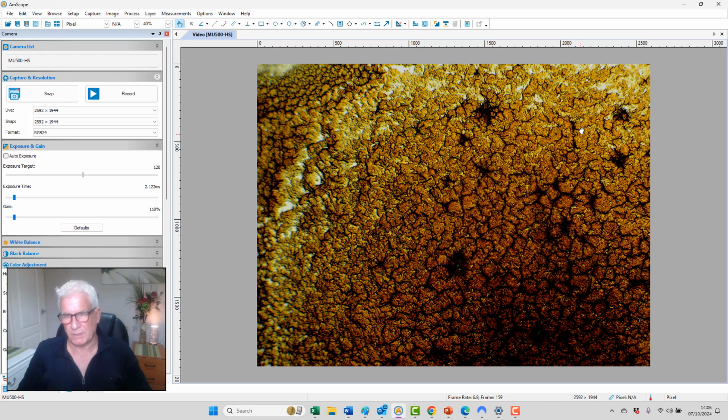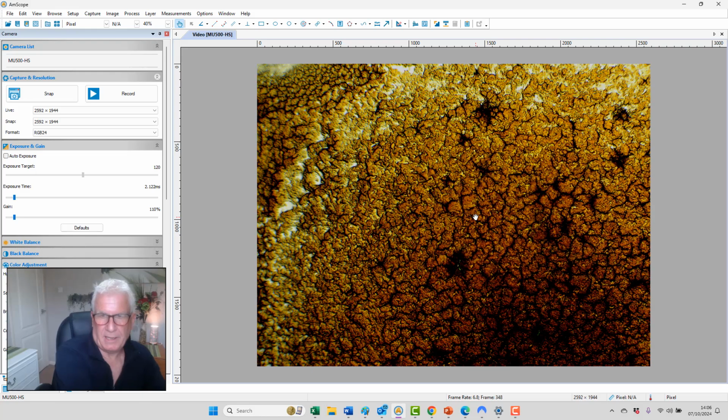They're actually not parasites. We're not looking at the parasites, but what we are looking at is where parasites are in the body. By definition, parasites live off the body. They create a little bit of damage. And when they do that, this black stuff, this is fibrin, a clotting protein. It'll accumulate in that spot because it needs to heal. It needs to stop the bleeding. It's only happening on a very, very micro level, of course. But yeah, wow.